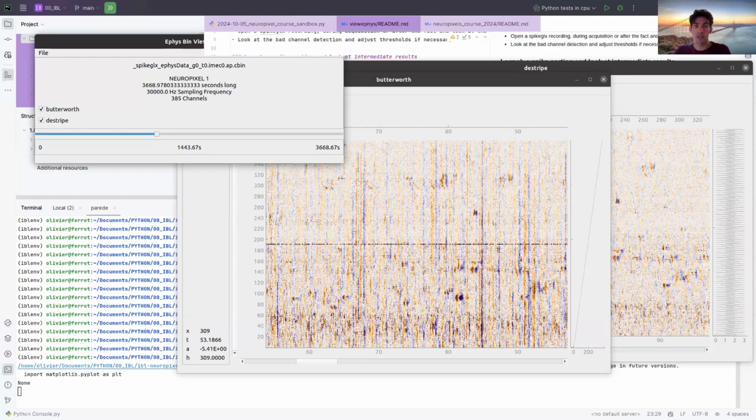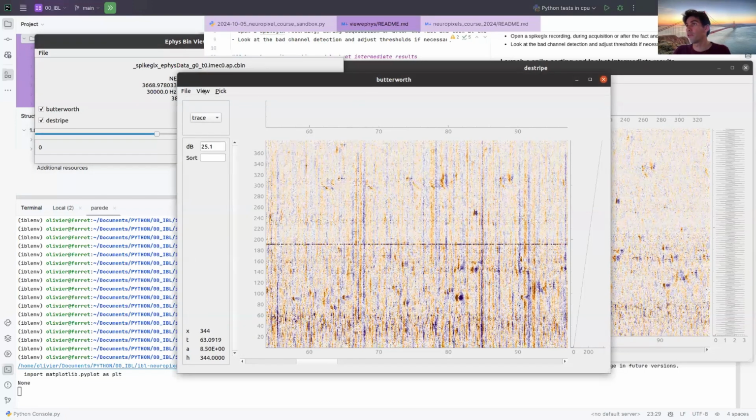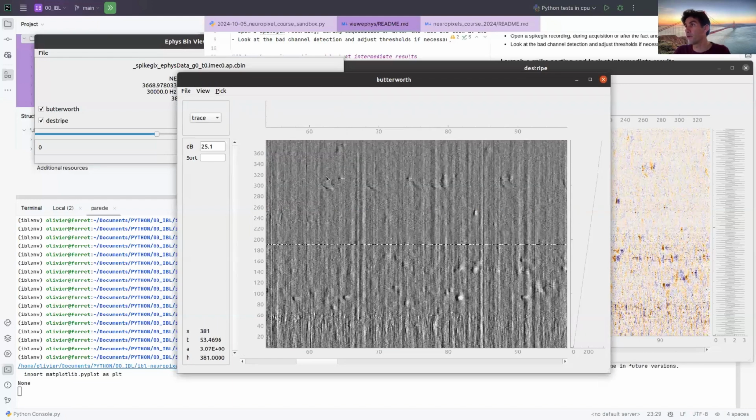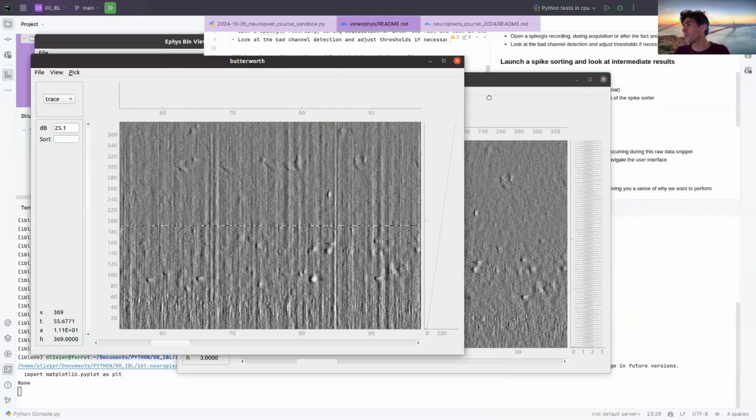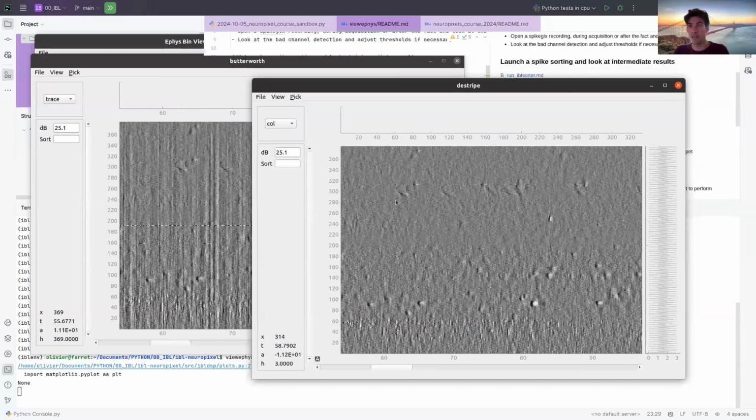What's the difference using different color maps? It's a matter of personal preference. Some people really prefer the gray, and some people prefer the other color map. Not everyone sees the same things. Some people are colorblind, so it's really about that.